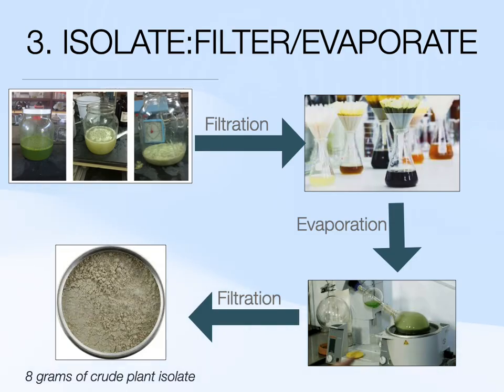The component of interest, of course, is the solvent itself, as it actually would have been stated before, is the vehicle or the mobile medium by which the phytochemicals themselves have been removed. Once we separate the solvent from the plant residue, which is in the funnel at the top, we're now able to conduct a further separation. But this time, that separation is by way of heat.